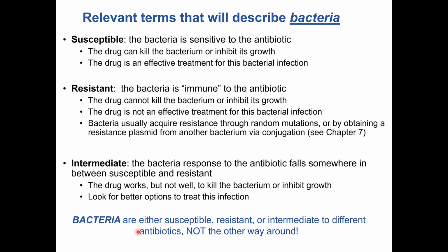The takeaway from this, and what I want to emphasize, is that it is the bacteria that are either susceptible, resistant, or intermediate to different antibiotics. It's not the other way around. Drugs cannot be resistant to things. If you are resistant or susceptible to something, you have to be living. And that's what we're talking about here. So use these terms to describe how the bacteria responds to the different antibiotics.